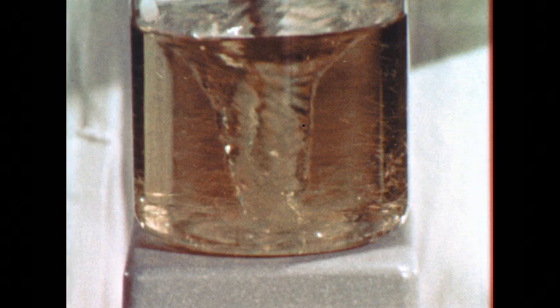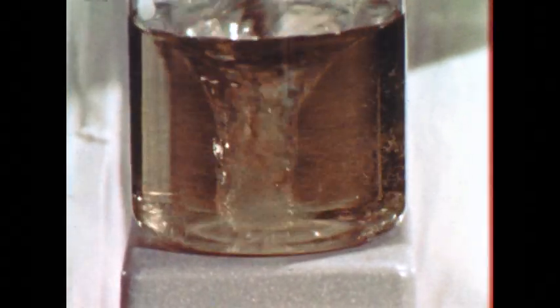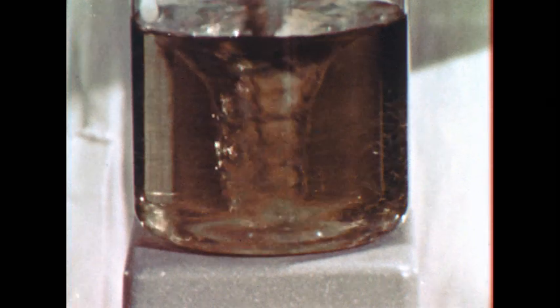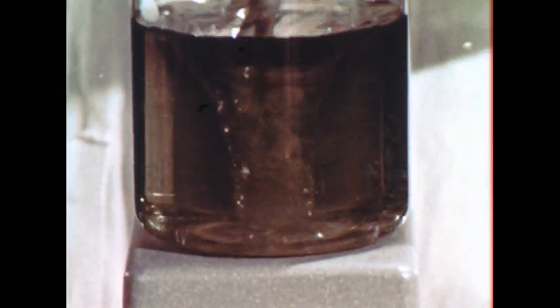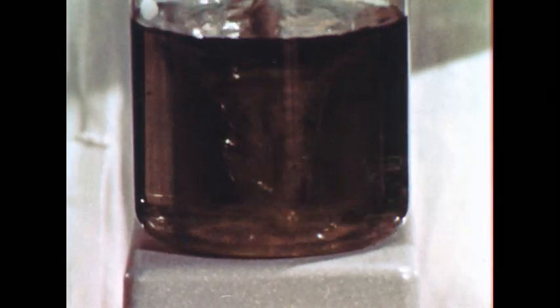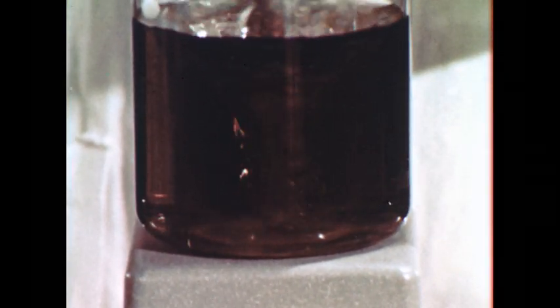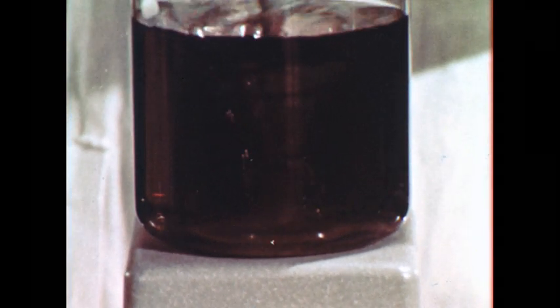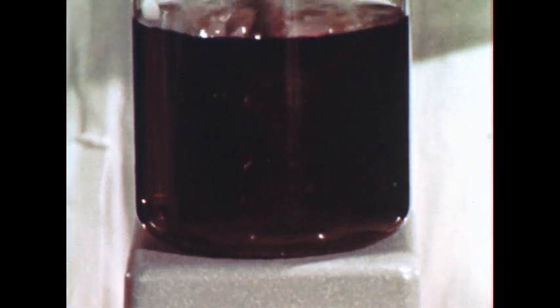Each indicator changes color over a narrow acidity range. The range depends on the acid strength of the indicator. Continued addition of base allows the weaker acid, HBB, to donate protons. Finally, the phenolphthalein donates protons as the hydrogen ion drops to about 10 to the minus 9th molar, and the solution turns violet.